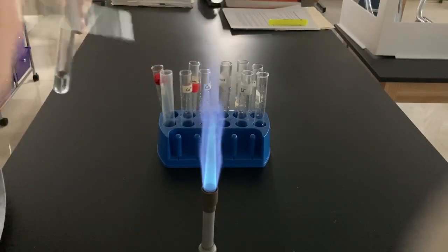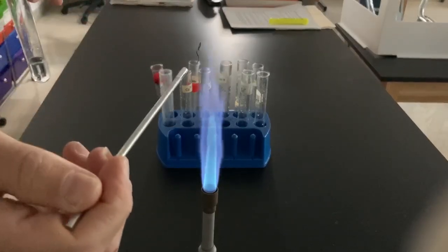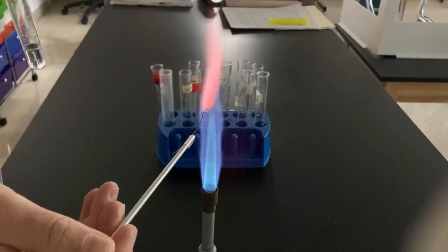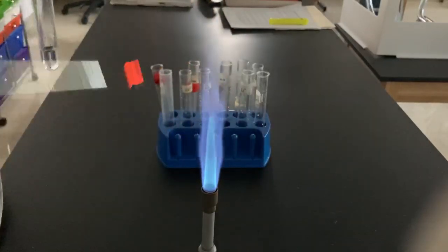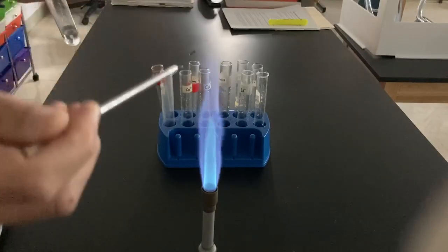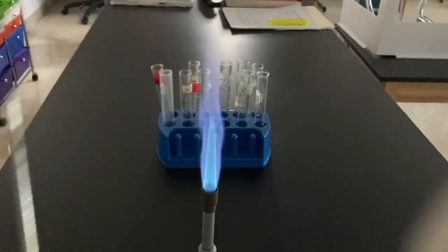Next up, potassium. Potassium can be hard to see, so again, watch initially. We had some purple, we had some violet in there. Let's try again with more potassium. Purple and violet right at the beginning — looks very nice there.